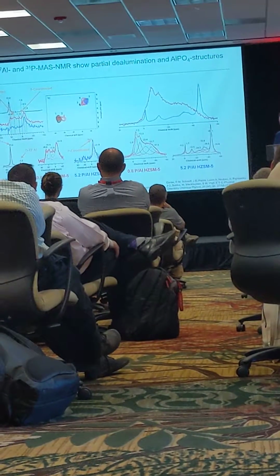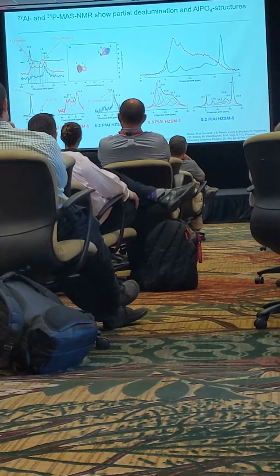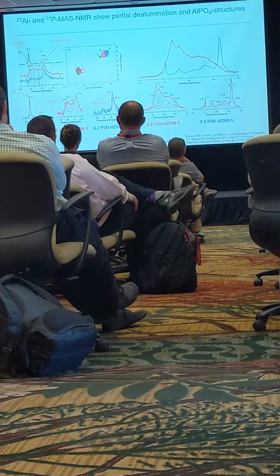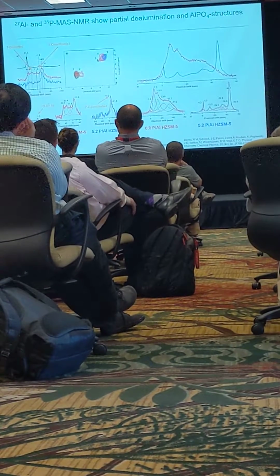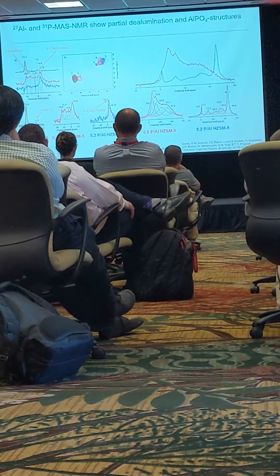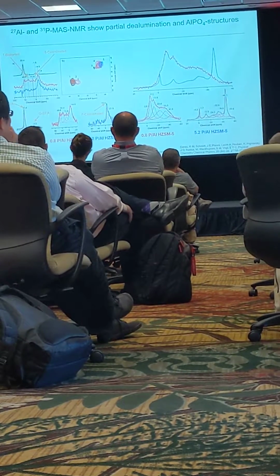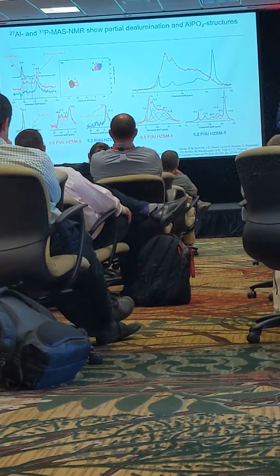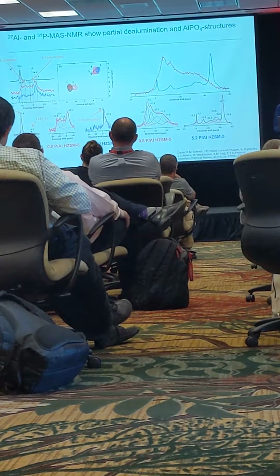The next one is the blue scan on the right. Very dramatic shift again from that extra phosphorus. It makes you understand that it's really an optimum with that phosphorus loading. Here, that tetrahedral peak is basically gone, and now we have a peak that's quite big, and we understand that that's associated with octahedral aluminum, and it's probably got a fairly distorted electronic cloud around it from the phosphorus.